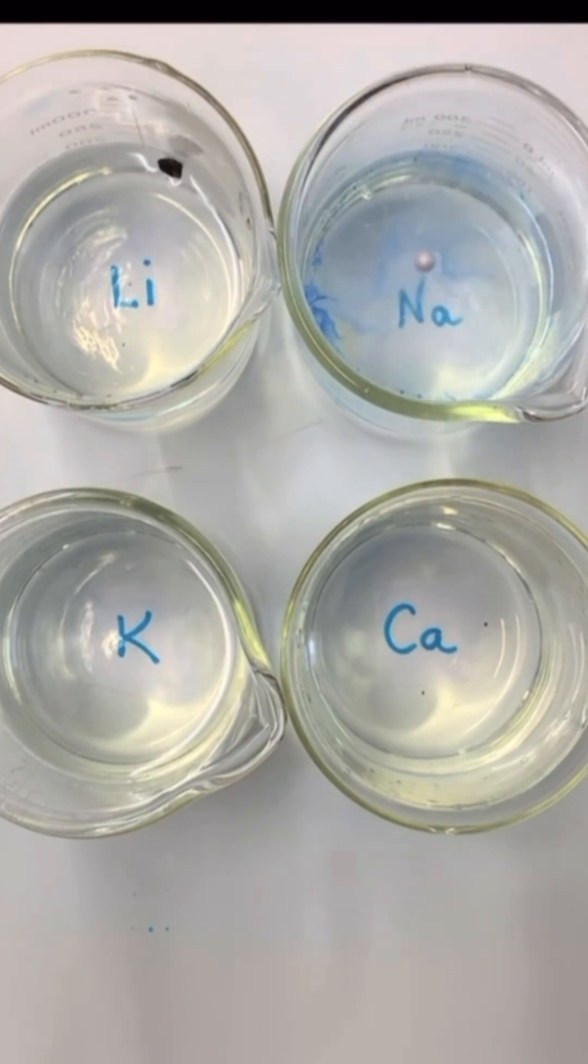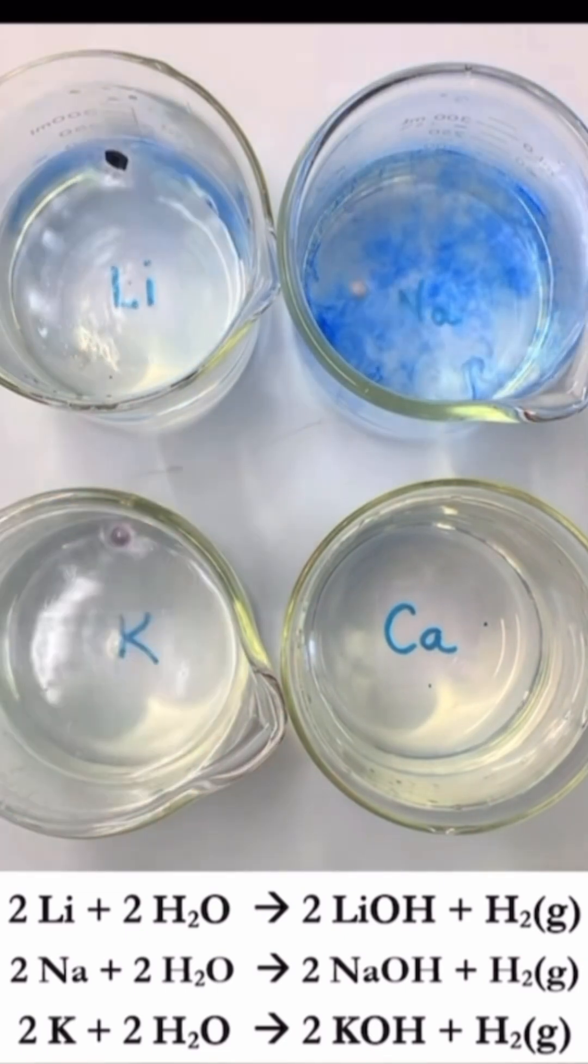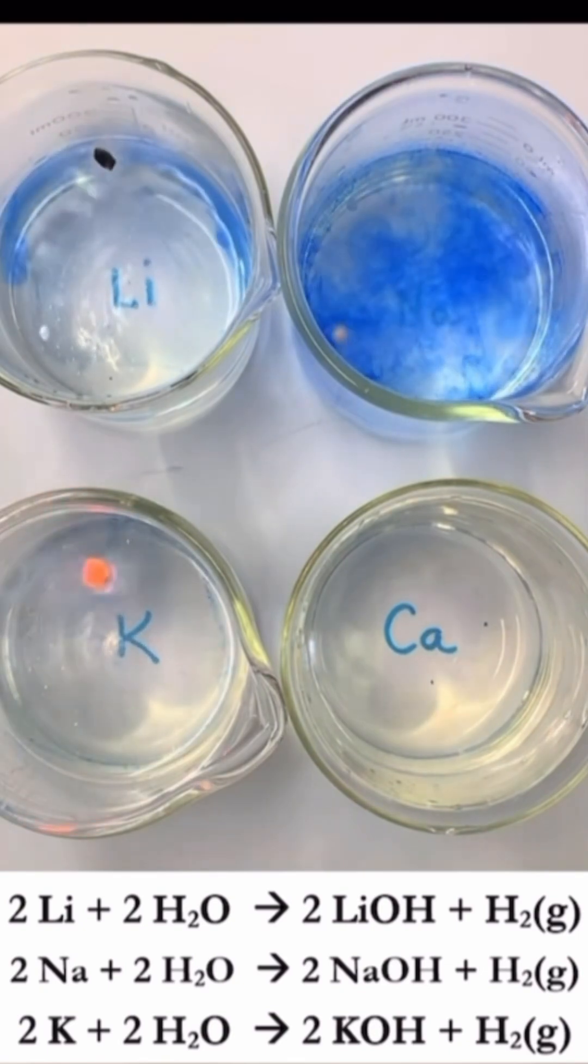Lithium. It reacts slowly, releasing hydrogen gas and turning the universal indicator blue. That's because it forms an alkaline solution, lithium hydroxide.